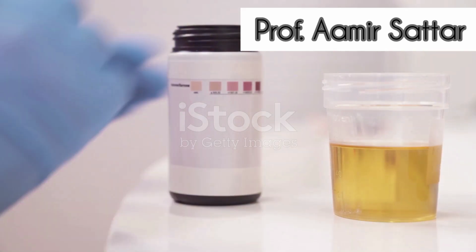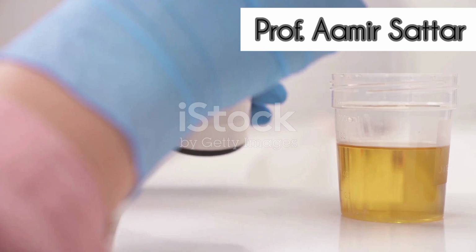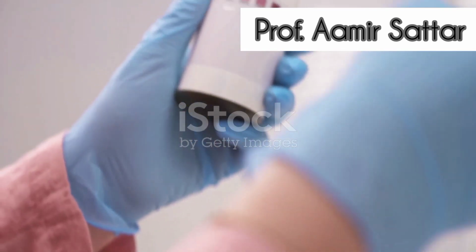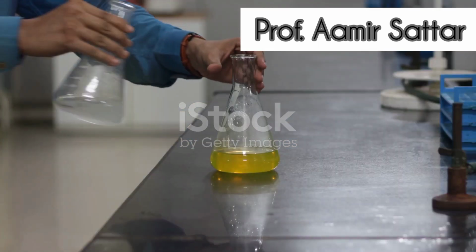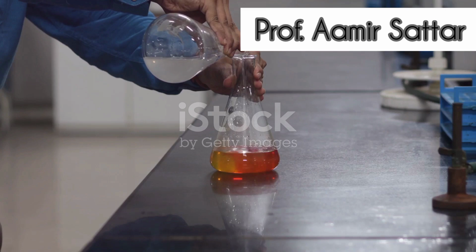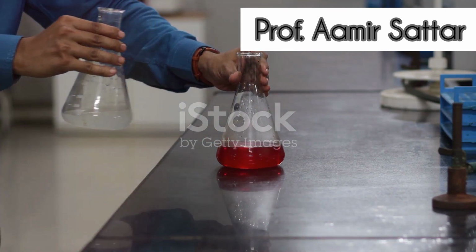The xanthoproteic test involves treating the food sample with nitric acid. A yellow color solution indicates that proteins are indeed present. Similarly, the Millon's test uses mercuric sulfate in the presence of sodium nitrite and sulfuric acid to produce a brick red color solution, again confirming proteins.